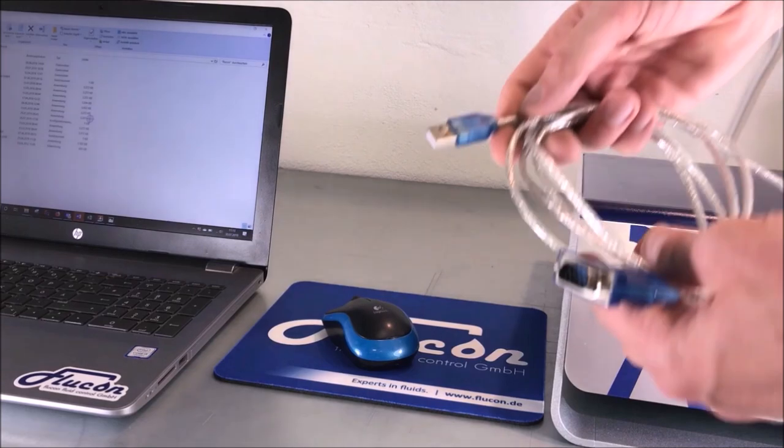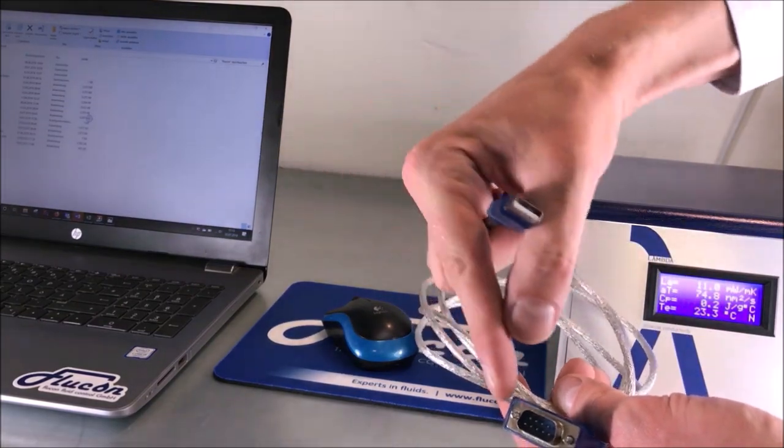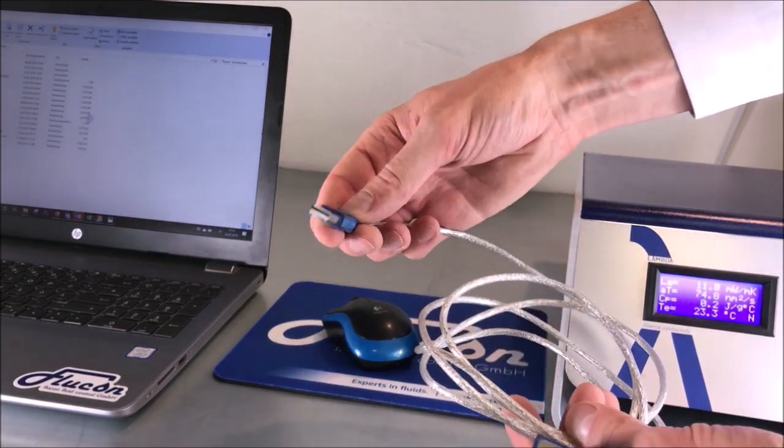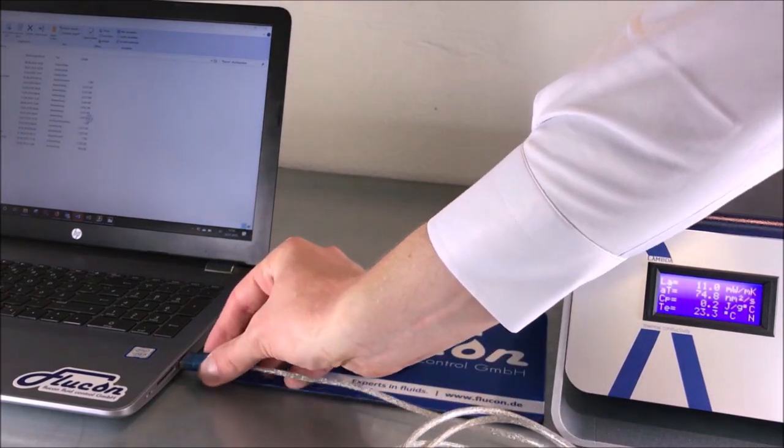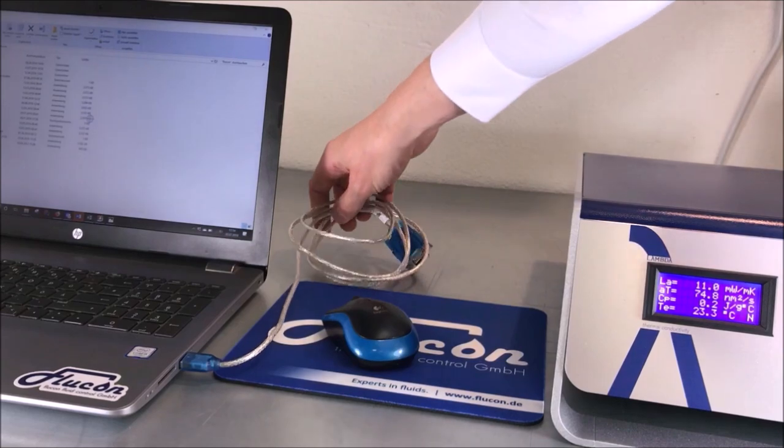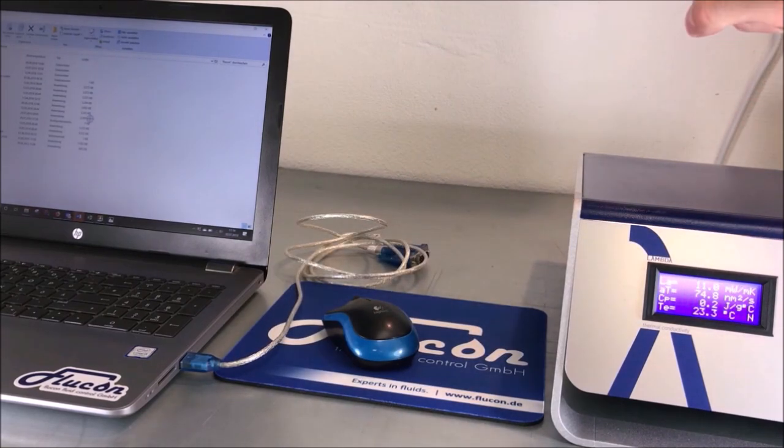If your computer or laptop doesn't have a serial port, you can use the serial to USB connector for adaptation. Make sure that you plug it into the USB port of your computer first and that its driver was installed correctly before connecting the Lambda.